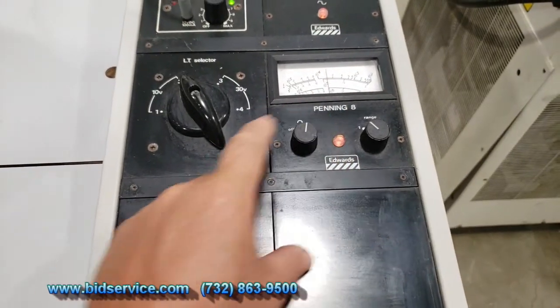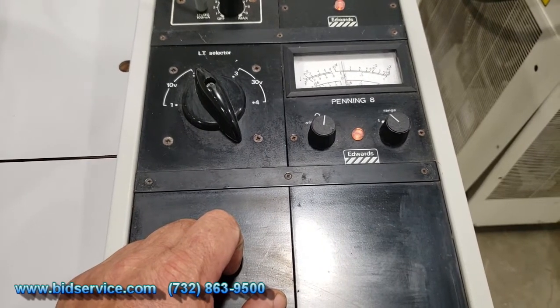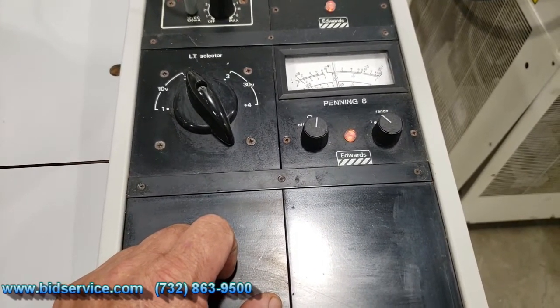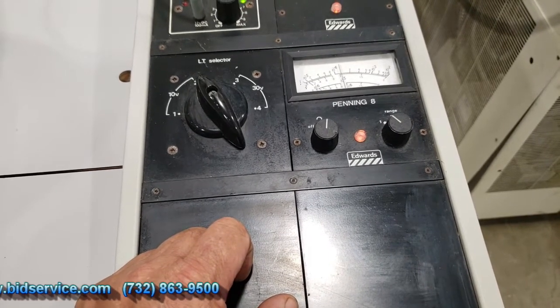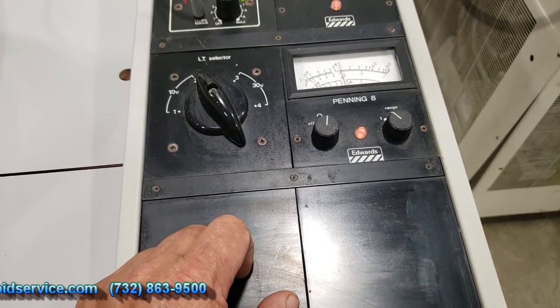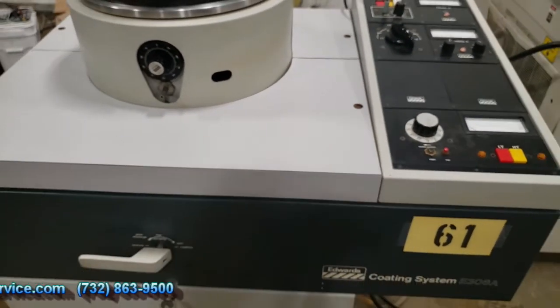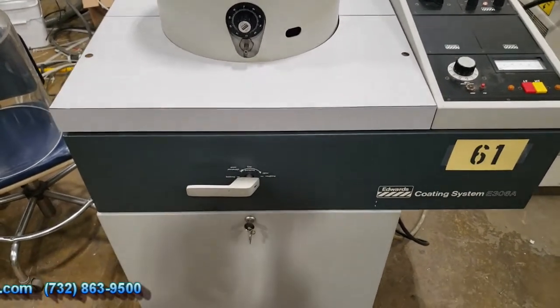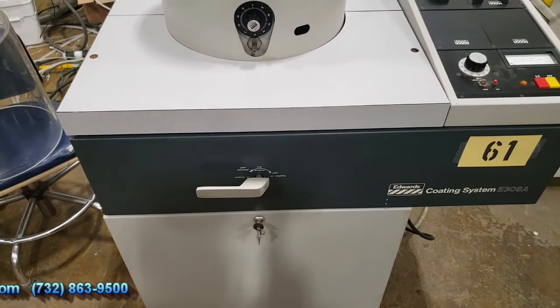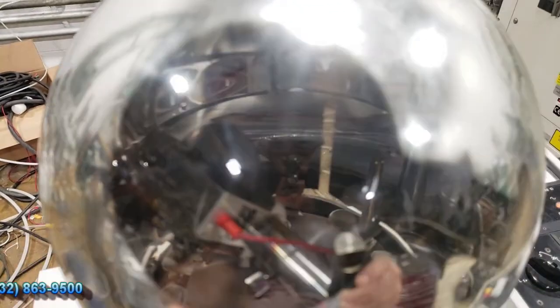About one torr right now. You've got to give it about an hour for it to pump all the way down — it all depends on what type of material and how much you deposit on the inside of the bell jar. As you can see, it's even got the spot of where it hit.